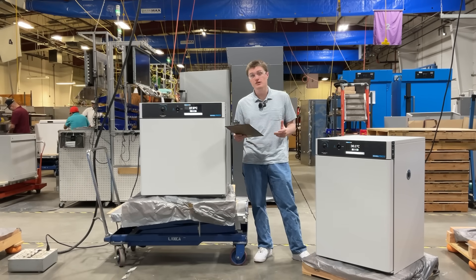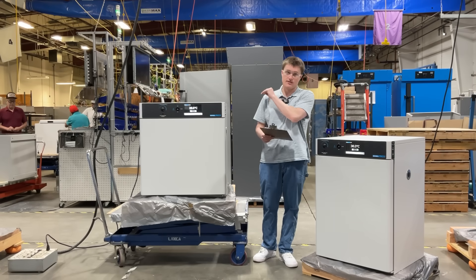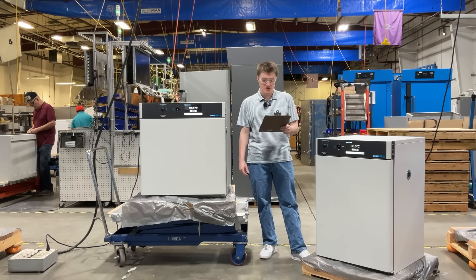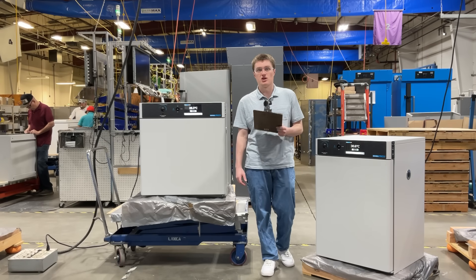When precision, reliability, and efficiency matter in your lab, the SMI-6 and SMI-7 microbiological incubators are the ideal choice for microbiology, pharmaceutical testing, life sciences research, and cell phone manufacturers to test their products before release into consumer markets.